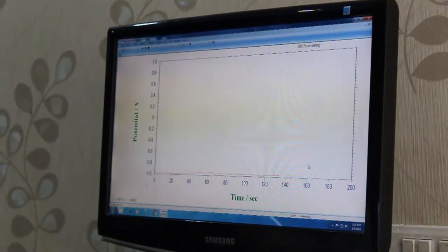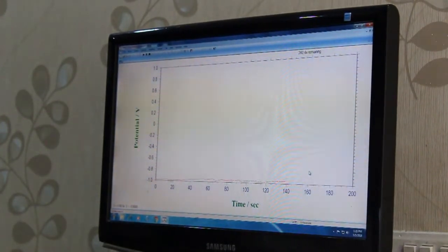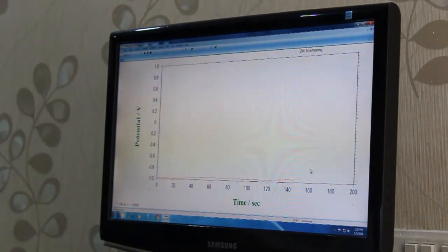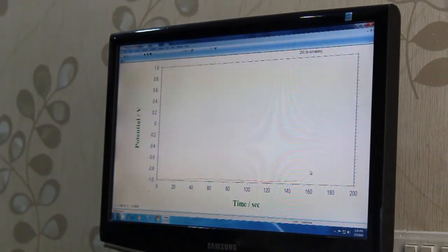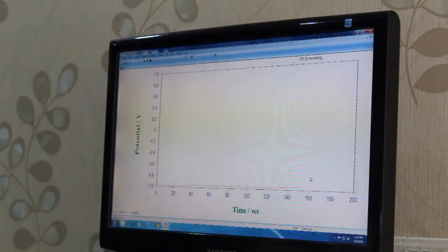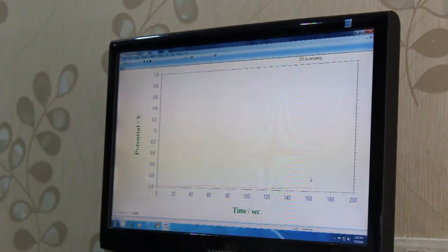I could have cleaned it while putting the electrode back, before putting the sample in, a little bit. That eliminates one possibility, and you end up with only the problem of the equilibrium. So minus 0.95, something like that. I'm not happy with the things so far.